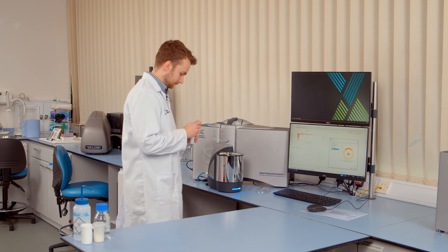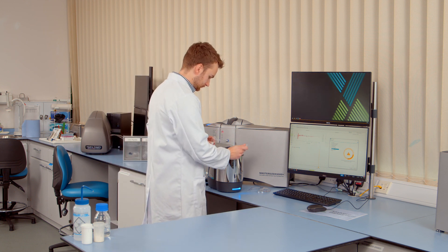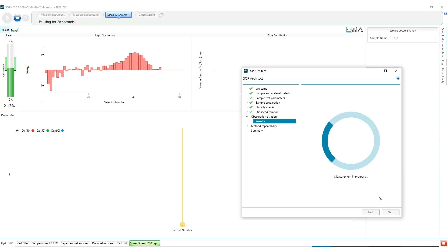So I'm now going to add the sample into the dispersion unit aiming for a target obscuration value of between two and three percent to begin the obscuration titration. So now that we've reached our target obscuration value it will now stabilize for 30 seconds before carrying out six repeat measurements.